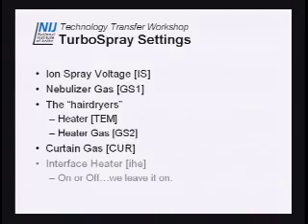So the turbo spray settings. Turbo spray is Applied Biosystems' way of saying electrospray. It's turbo because it's got the gas and it's heated. The parameters are the ion spray voltage, the nebulizer gas, and the hair dryers, which both have two parameters to set them. One is the temperature, one is the heater gas, which is GS2, which is just basically how much that's flowing out. And then the curtain gas, and there's another parameter in there called the interface heater. We just leave it on, and there's nothing to optimize on or off. We choose to leave it on, works fine.